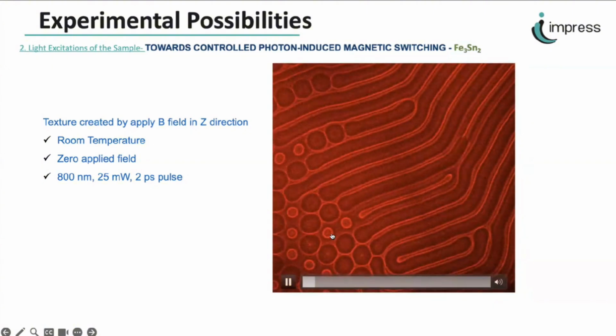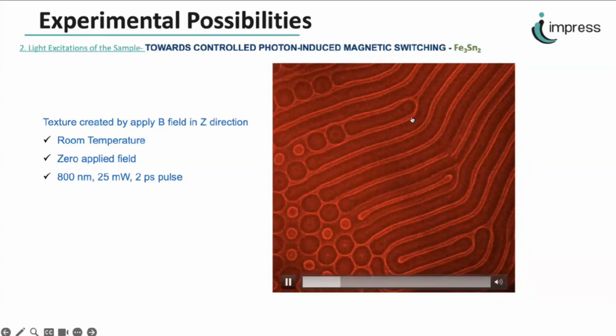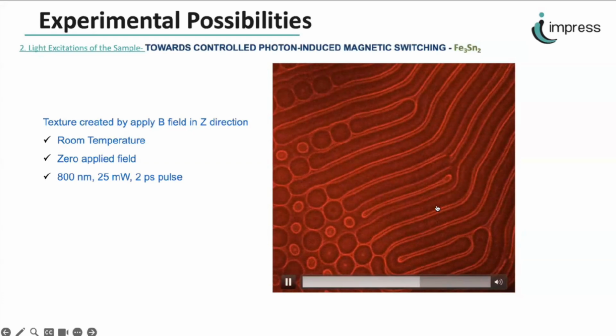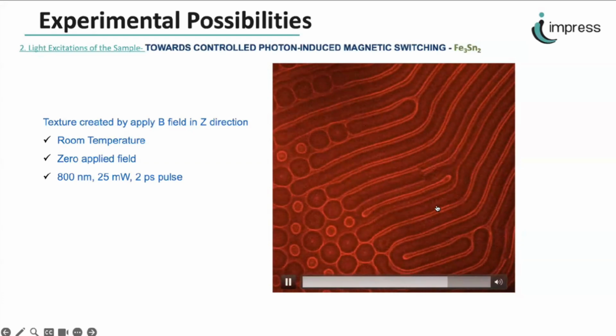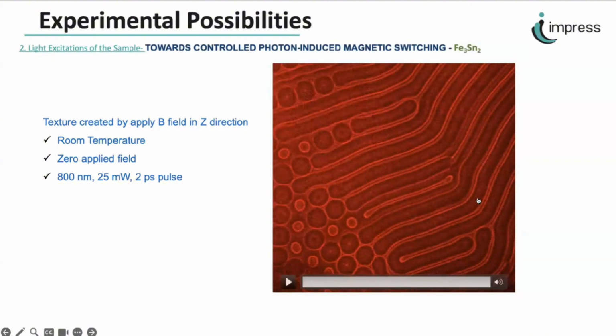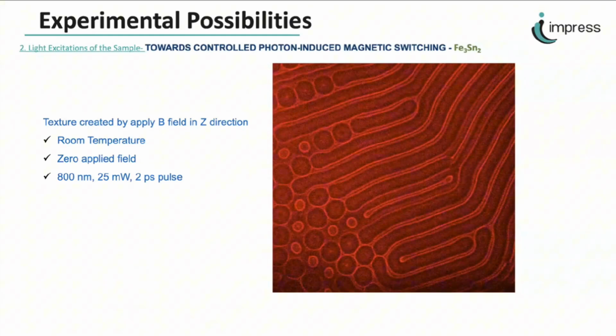And then you can see the changes not only in these magnetic bubbles, but also in the helical phase and the stripes that are formed. As you can see, at different slides, they are changing. And this gives us a hint how to create and design novel material systems for the next generation of spintronic devices.